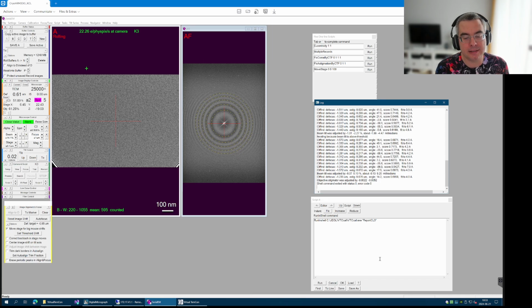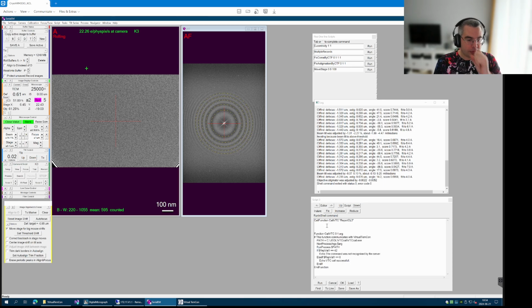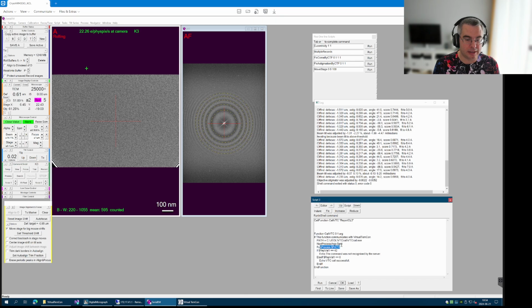However, when we tested it in Osaka with Makino-san, we realized that this is actually quite slow. Run in shell takes a huge toll on the throughput. This is because Windows takes a long time to display the command prompt, and there is nothing we can do about it. However, new SerialEM does have the run process and next process arguments commands. I just copy them from here and I put them here.